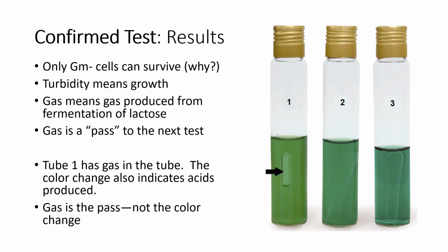So the person whose well water came up positive in the presumptive test in the lactose broth, very concerned, says, oh my gosh, there's feces in my water. And I would say, hey, you don't know yet. Here, at the end of this confirmed test, they would go home happy knowing that whatever is giving them gas in the lactose broth was a gram positive, which means this is not fecal. It's not E. coli. It's not fecal. And so what you would know is you have bacteria in your water, and you probably do. Okay, bacteria are everywhere. So unless you literally sterilized your water, yeah, you got bacteria in there. That's just the way it goes.